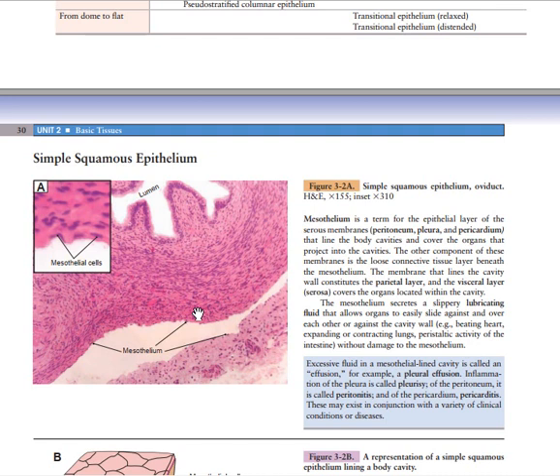That's a mesothelium. So do you see the mesothelium is going to be located both between the visceral part and the parietal part here. So we have the mesothelium, and then in this insert we are going to have mesothelial cells, and those mesothelial cells are flattened cells which are epithelial cells. Also at the lumen you also have epithelial cells here.